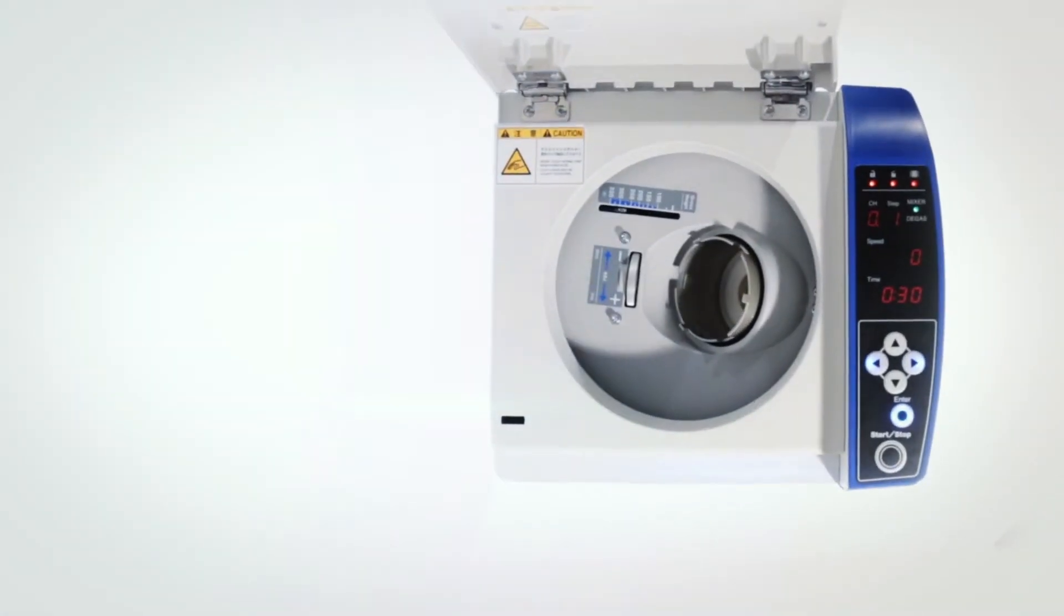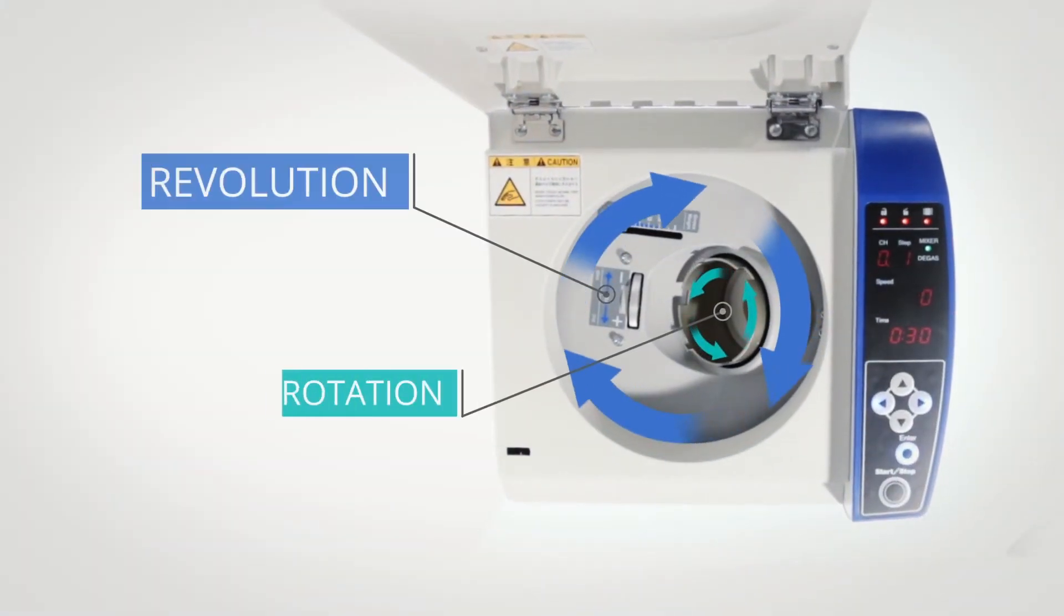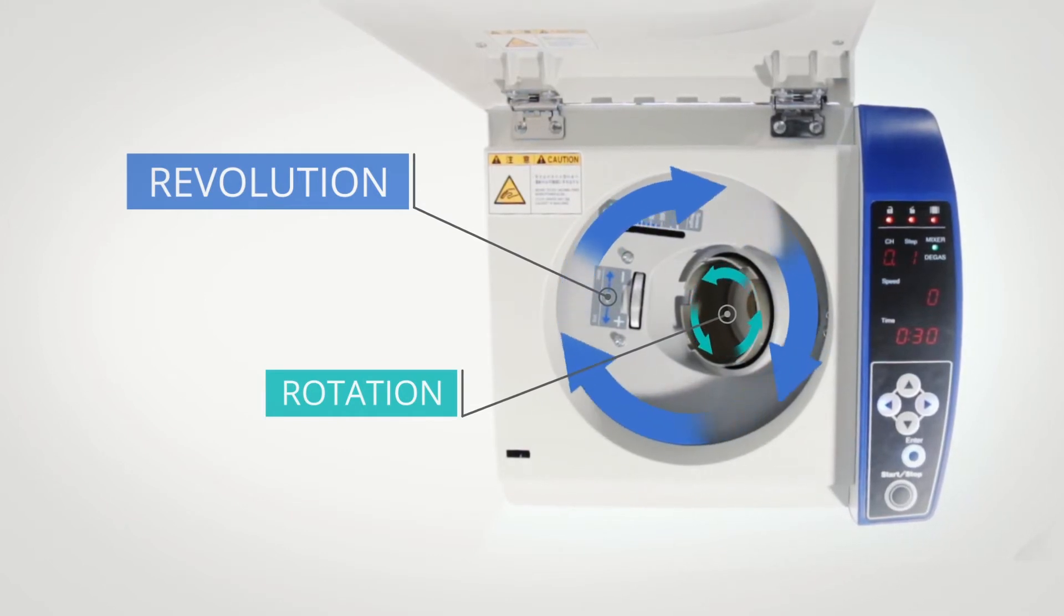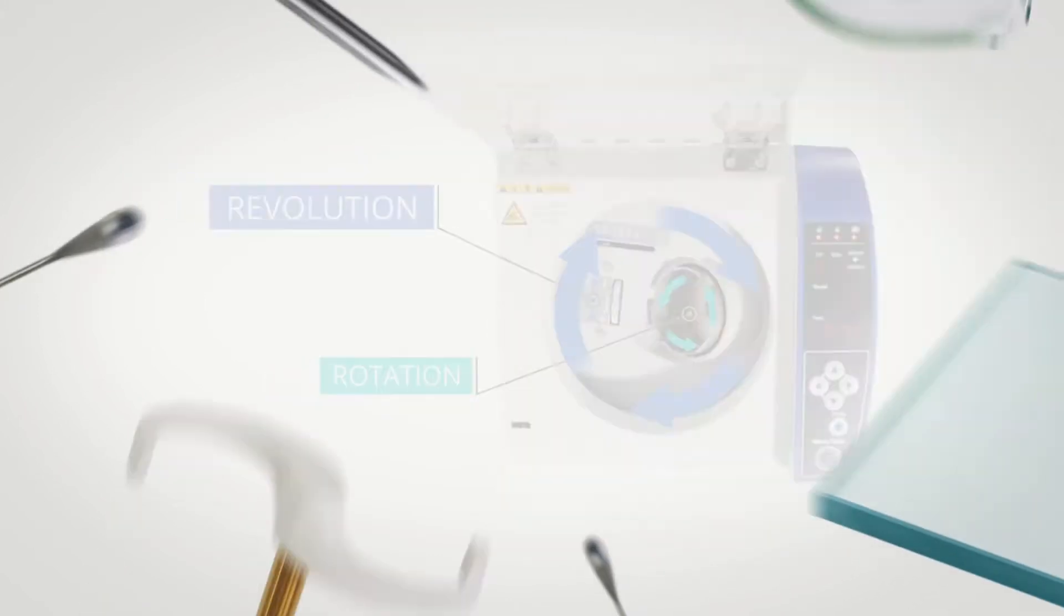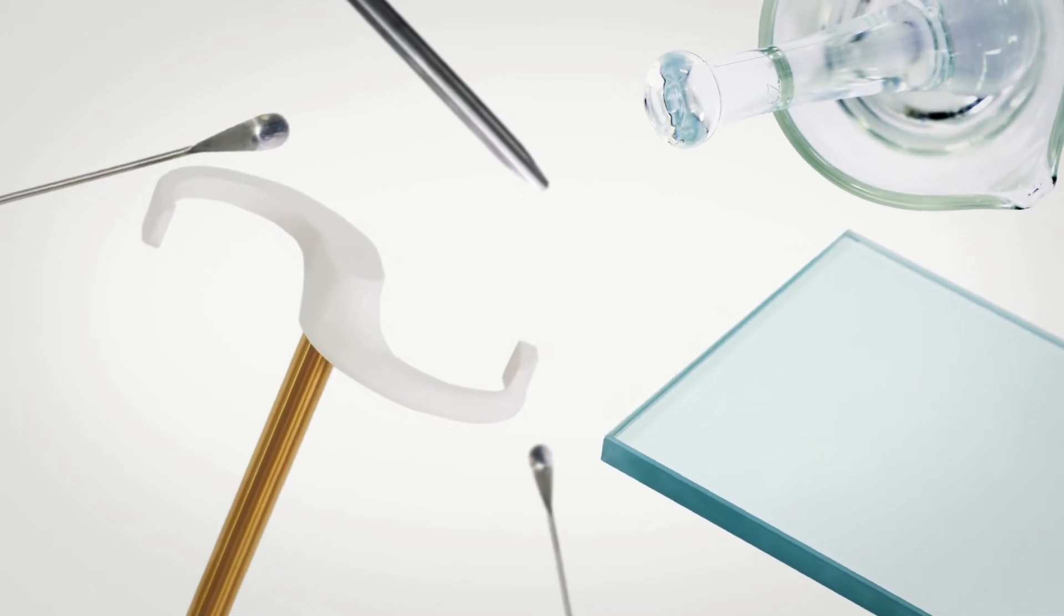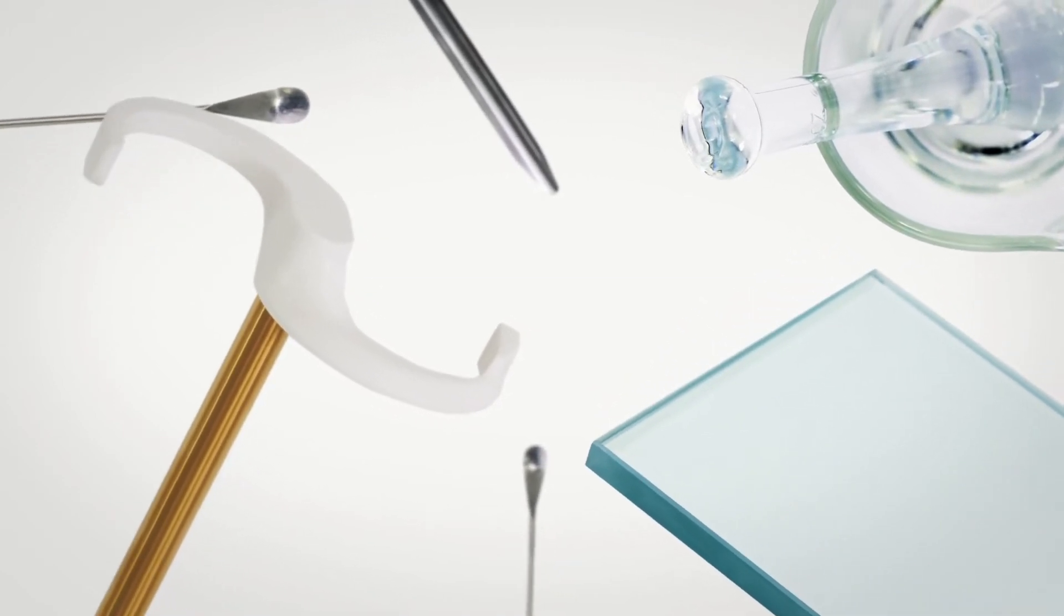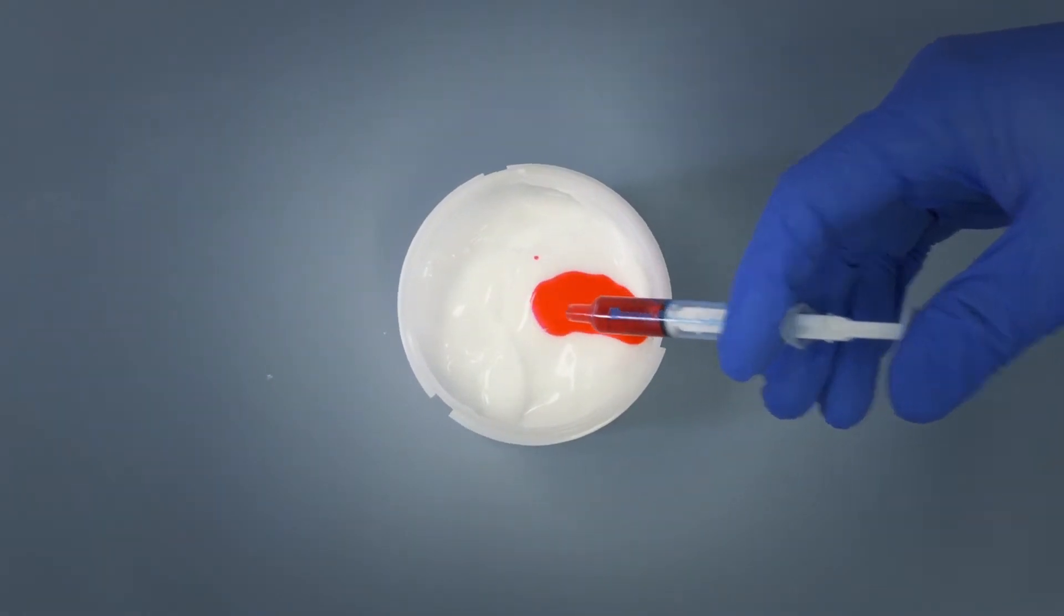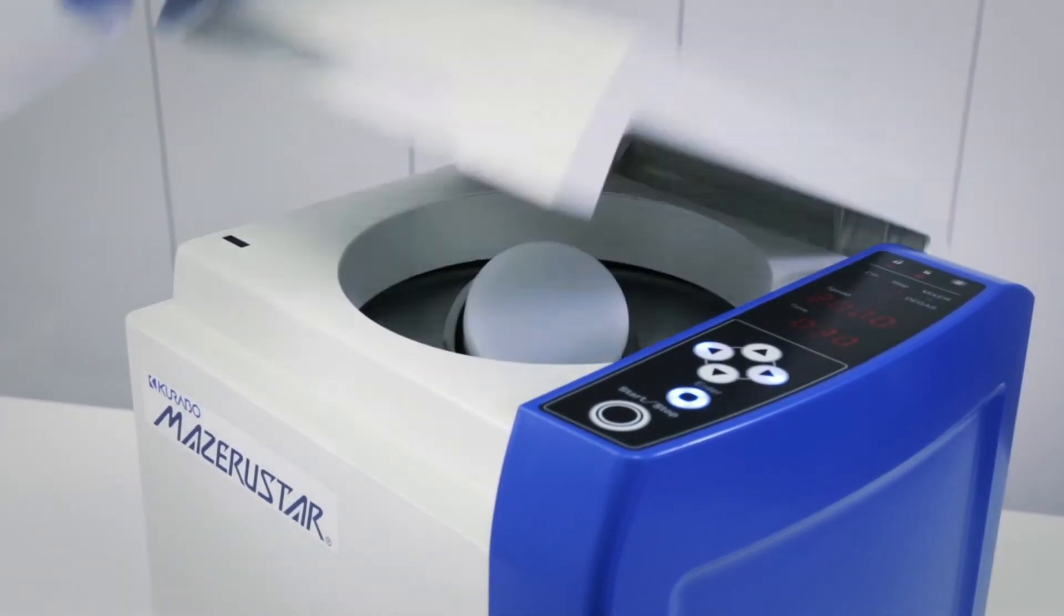This technology works by simultaneously revolving and rotating a mixing vessel around a central axis. It is a unique planetary motion that eliminates the need for mixing rods and lengthy procedures, thus dramatically reducing preparation, cleaning, and mixing times compared to conventional methods.